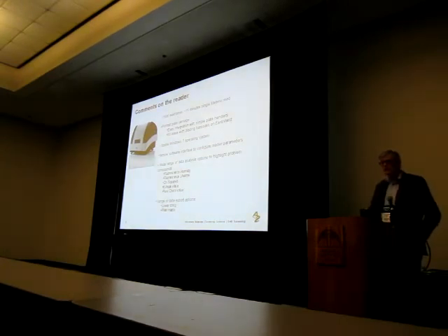One of the really nice things, and Pierre alluded to this in his 10-15 minute talk at the start, is the additional information you get. You don't just get a fluorescence lifetime read out of the instrument. You get a fluorescence intensity read, and the software uses this additional information to flag up and highlight wells that may be a concern. That's nice to be able to see, because it gives you a really quick, easy way to identify where you've got a problem, if you've got a problem at all.